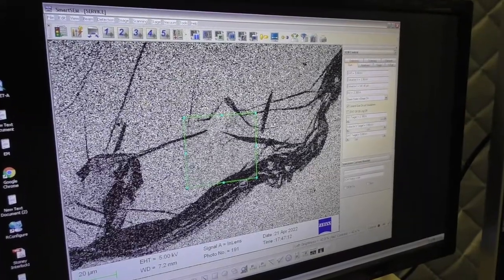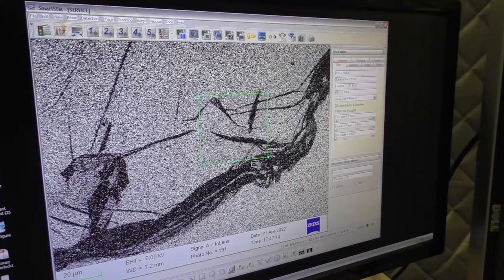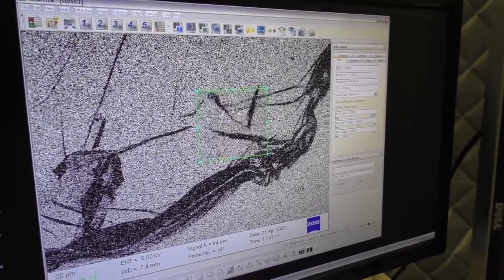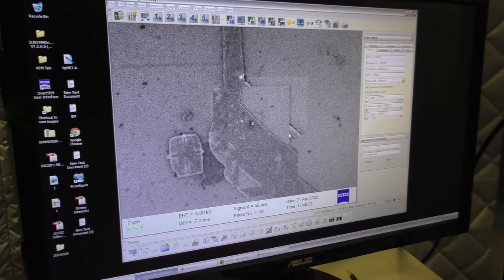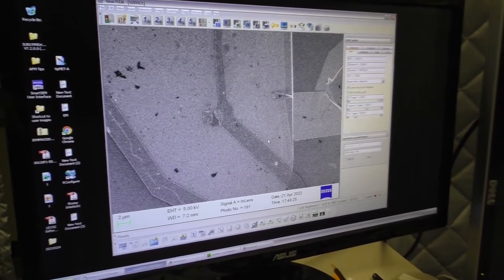To get a clearer view of the sample, we need to fine-tune the beam by making it point-like and focusing precisely on the sample surface. After some fine-tuning, we get a nice clear image.